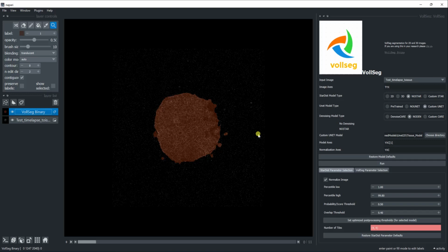And in this way, you can very quickly on your GPU computer or your laptop actually get the segmentation of the time-lapse sequence without having to go through the complications of Jupyter notebooks, where you would have to know if it's a notebook which is meant for a time-lapse or if it actually is taking a directory of Y and X images. Now it's simplified. Now you just make a time-lapse, use this model that you trained for getting the segmentation.